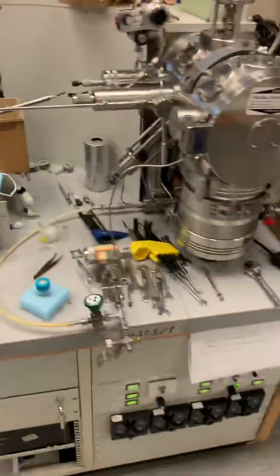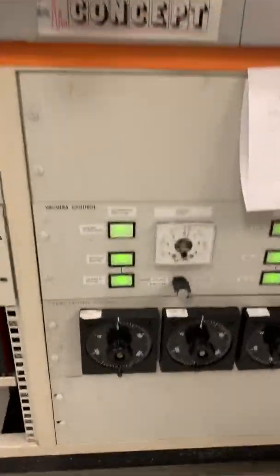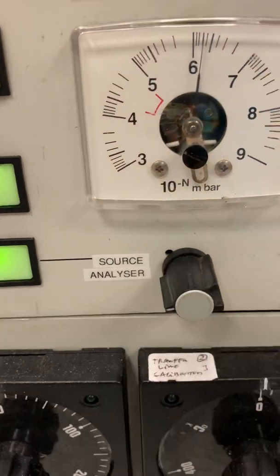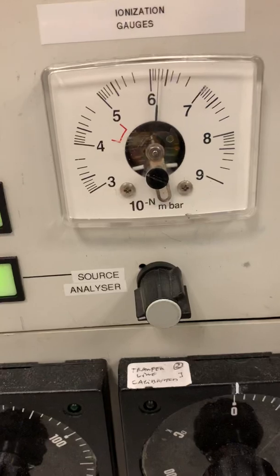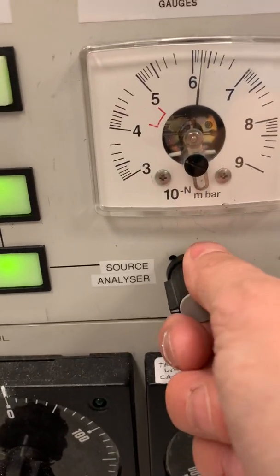The detector region has an ion gauge in it as well as the source. So this particular button here is reading the source pressure. If I now click it over, it now reads the analyzer pressure, which is where the detector is. So the same gauge is able to read two different ionization gauges.